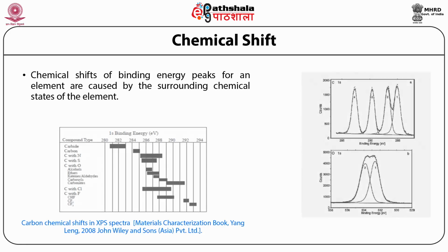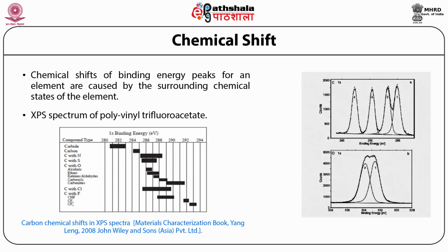For example, Figure 1 shows the XPS spectrum of polyvinyl trifluoroacetate, termed as PVTFA. The carbon atoms in different environments generate distinctive peaks as shown in Figure 1a.